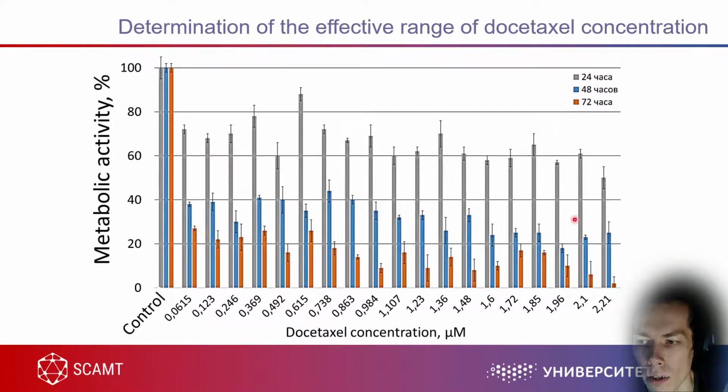And it's obvious to ask why. In most cases, with most anti-cancer drugs, there should be zero at this concentration. If even a nanomolar concentration reduces cell viability to 20%, 20 times more concentration definitely should go to, well, almost zero.